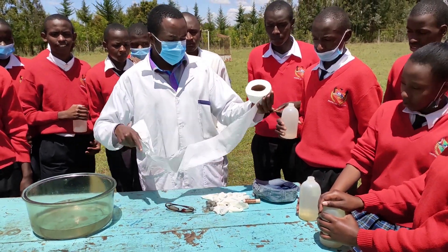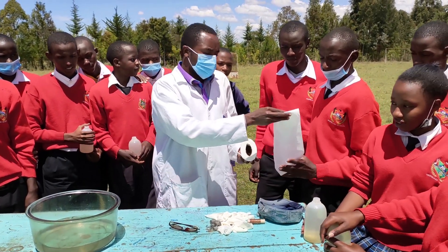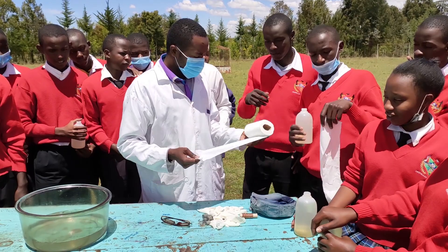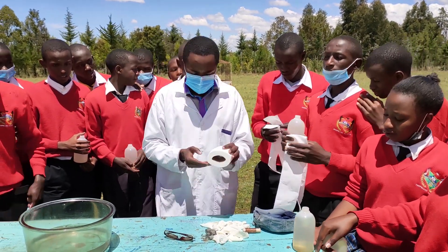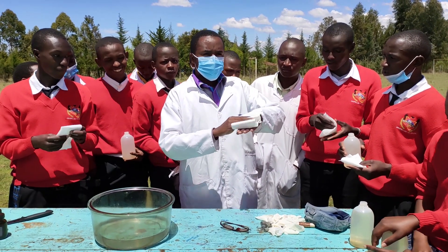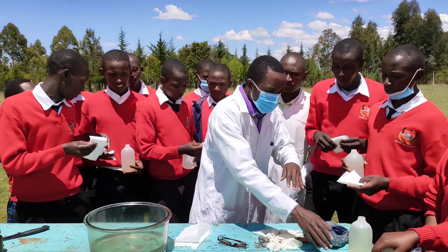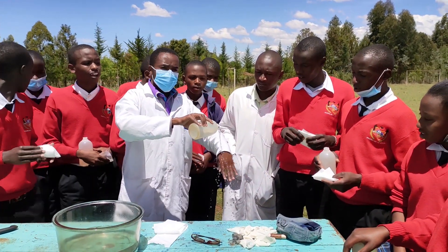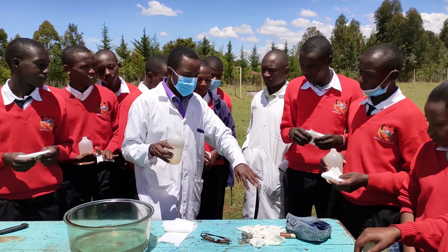Before doing this experiment, we had to take 6 precautions because, to be honest, this is a very dangerous experiment. Number 1: we had to do the experiment outside the laboratory. Number 2: I gave my students some tissue papers that they were first of all supposed to use to wipe themselves in case potassium hydroxide splashed on them, before irrigating themselves with lots of running water. Number 3: as the person who was to be closest to the reaction, I had to completely cover myself using a face mask, a cape, and most importantly, some glasses for my eyes.